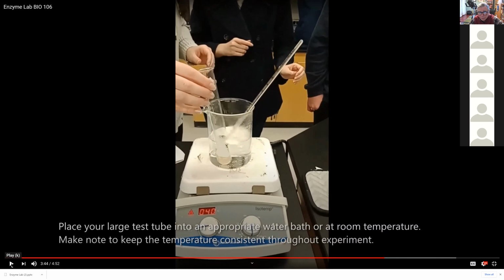So you put the test tube with the enzyme extract in a beaker of the particular temperature you're using to test the enzyme activity. This happened to be the hot temperature group. They were heating up water to 60 to 70 degrees. And you have to put the enzyme extract in there for about 5 minutes and use the same temperature throughout the length of the experiment.